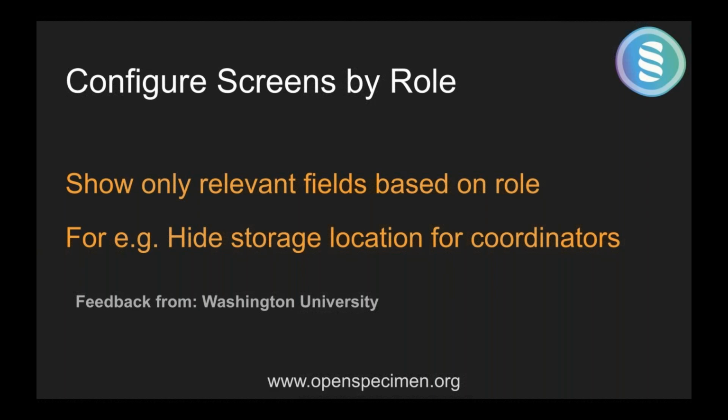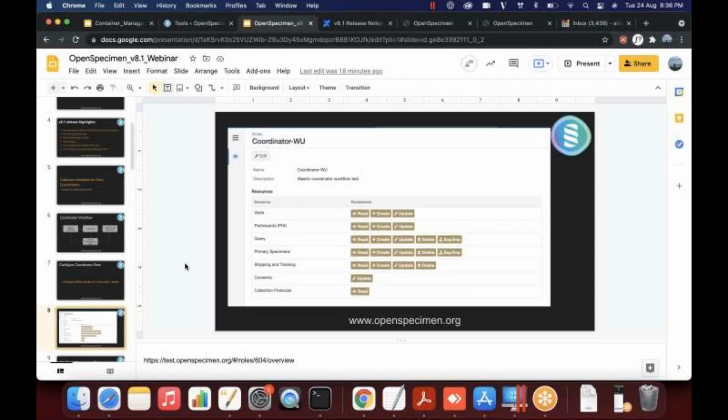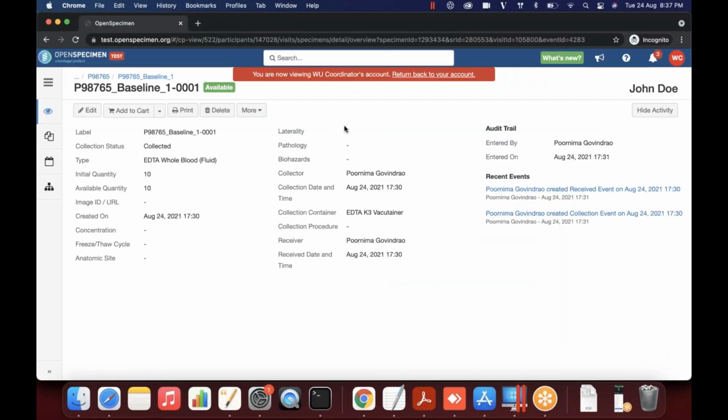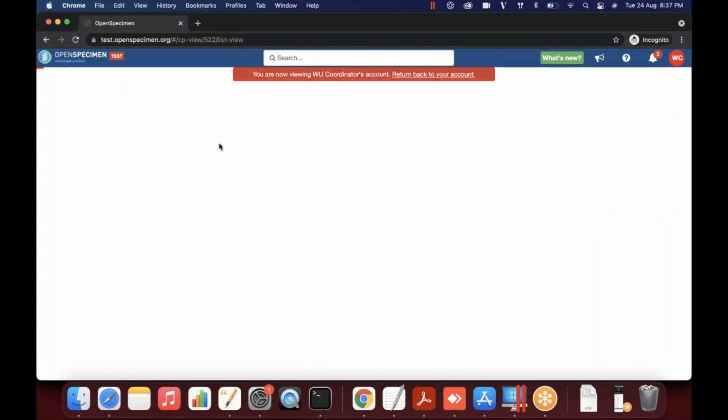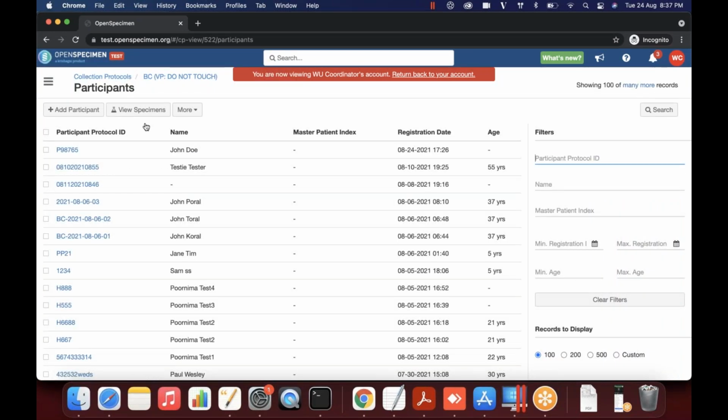Let me show what this is now. So I'm going to go into a sample protocol. I hope you are able to see my screen. If not, let me know.